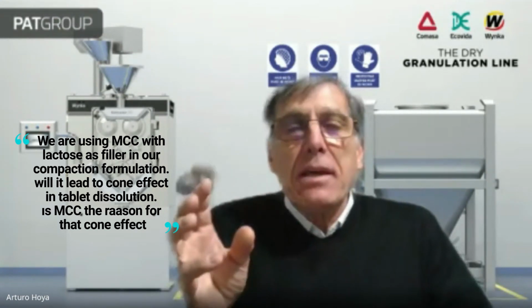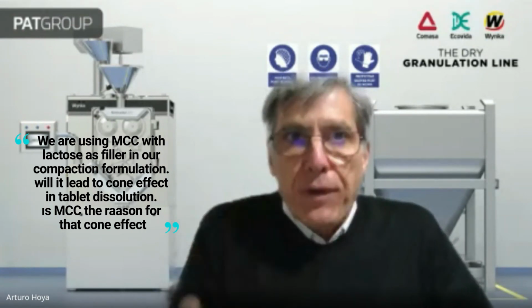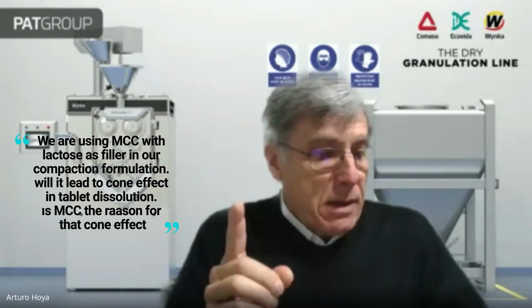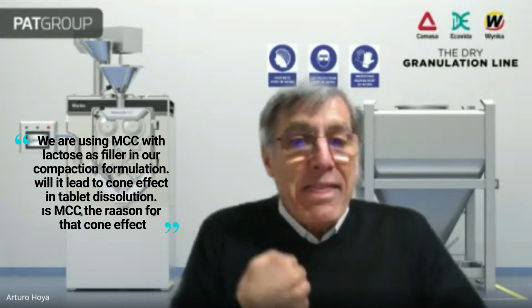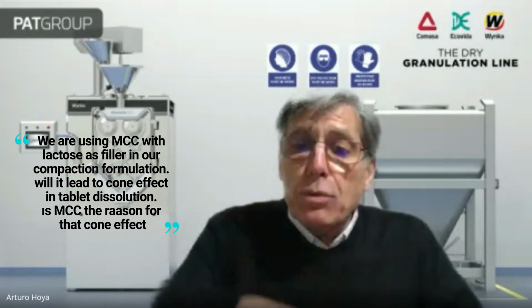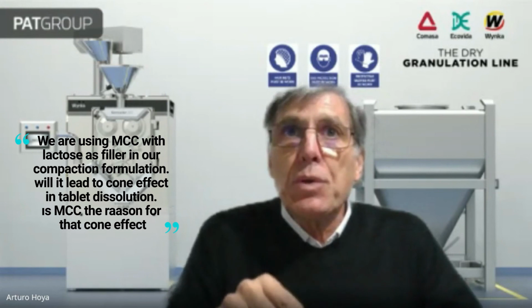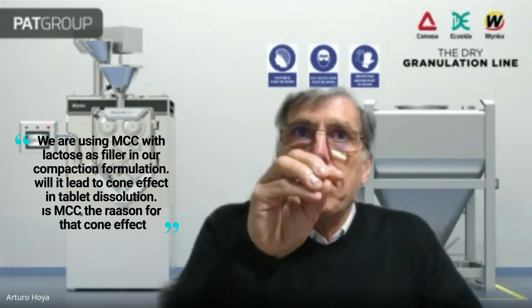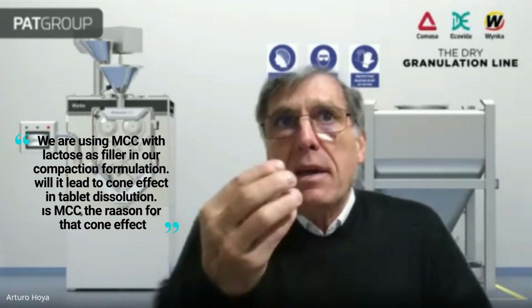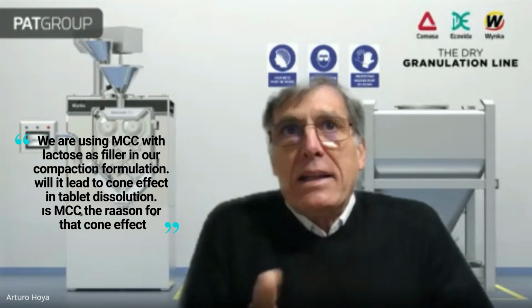I think that MCC is a hydrophilic but insoluble filler. So I think this powder cone in the bottom of the dissolution vessel is due to the MCC powder that is in the bottom and is not dissolved.